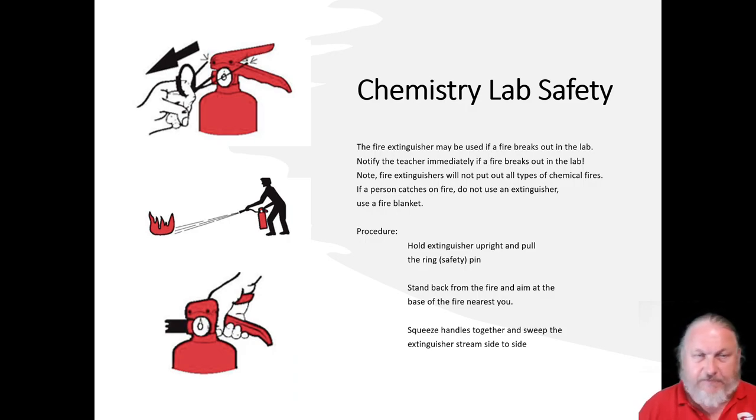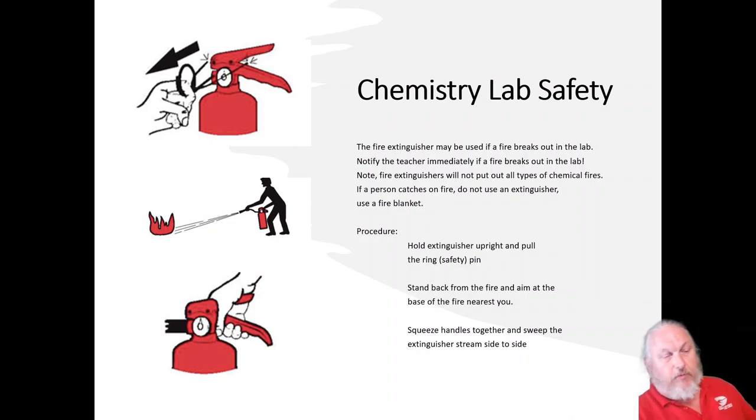Now what if we say fire, fire, fire? We have a fire extinguisher. The fire extinguisher can be used if the fire breaks out in the lab. The first thing you're going to do is notify me if the fire breaks out. Now the fire extinguisher will not put out all types of chemical fires. If a person catches on fire, don't use the fire extinguisher, use the fire blanket which I will show you where that's at. To use the fire extinguisher, hold the thing upright, pull the pin, the safety pin, and then step back away. And then you want to aim at the base of the fire, squeeze the handle together, and then sweep the stream from side to side.